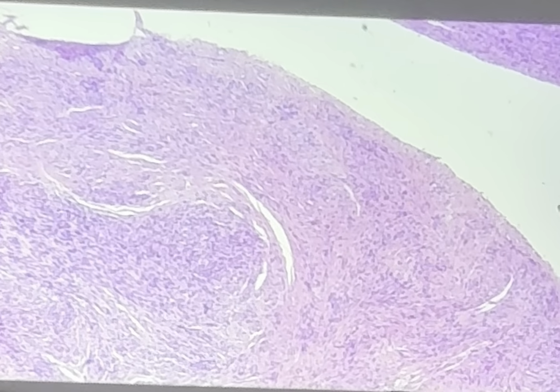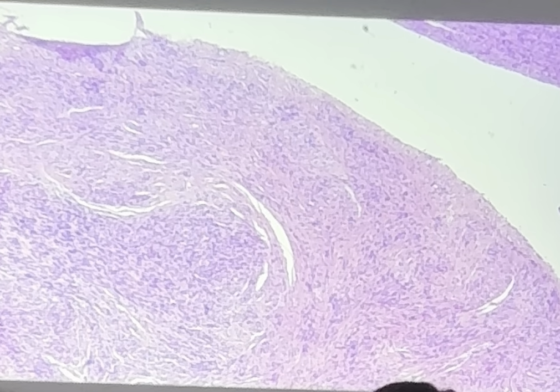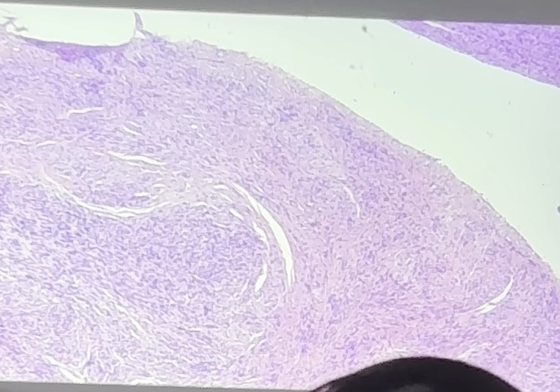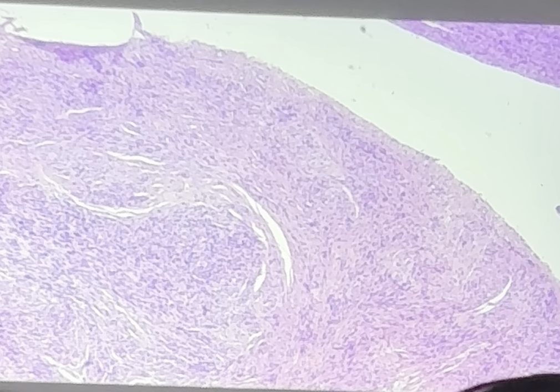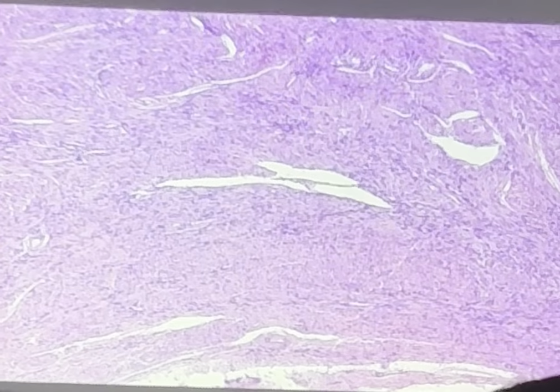Here it is. Myoma. Sometimes these myomas can get very big. I had one time a giant myoma that was so big they put it in a trash can. And these myomas are very hard to cut when they're fixed in formalin. Even if I have a giant knife and I'm beating it, it's really hard to cut. You can hurt someone if you throw it at someone because it's really hard. Yeah. That's just a myoma, but I just wanted to show you the secretory endometrium. Don't call it cancer. I'll show you the cancer later on when we go to reproductive.